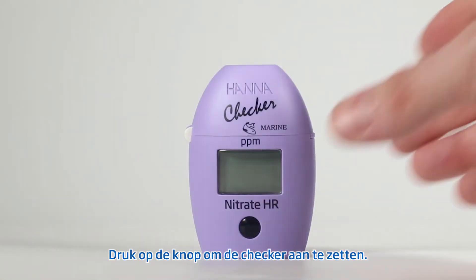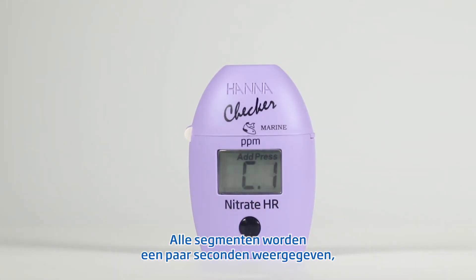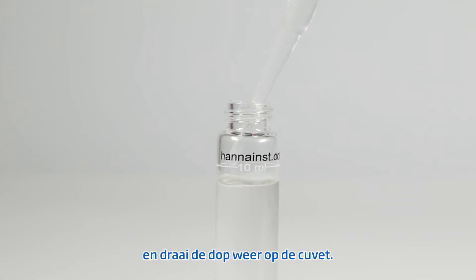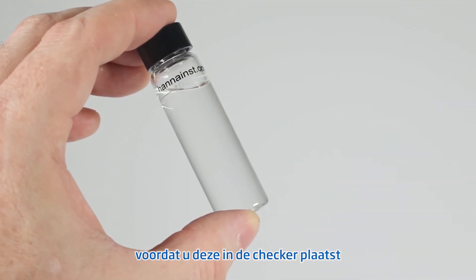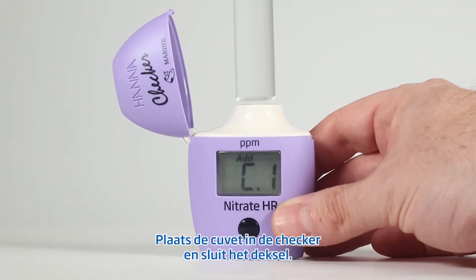Let's take a measurement. Press the on-off button to turn the checker on. All segments will be displayed for a few seconds, followed by 'add C1' with press blinking. Fill the cuvette with 10 milliliters of unreacted sample and replace the cap. We always recommend you wipe down the cuvette before inserting it into the checker. Insert the cuvette into the checker and close the top.